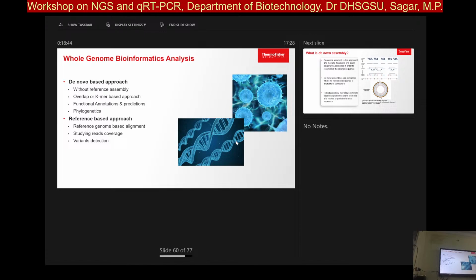Metagenomes. People working on metagenomes, they do lots of steps behind it. When you do an assembly, you like to assemble that, see what is happening, how many contigs are formed. Are we able to do a completeness check? That means whether any genome is going to be getting out of that or not. Genome completeness, 80%, 70%.